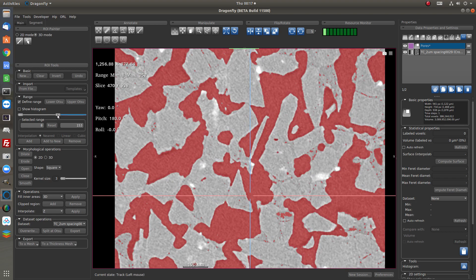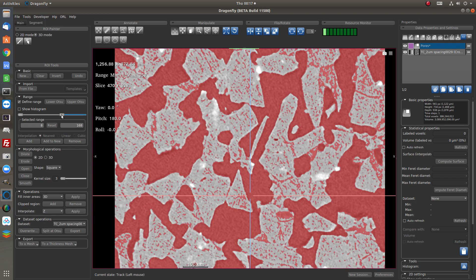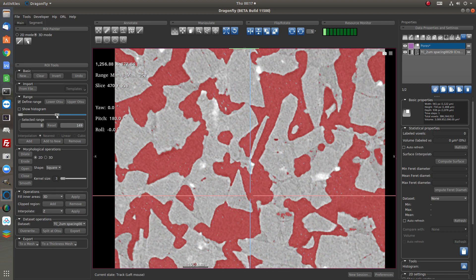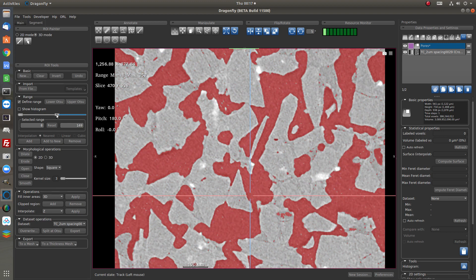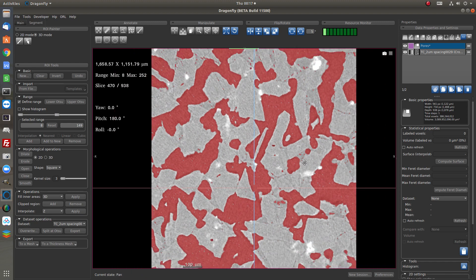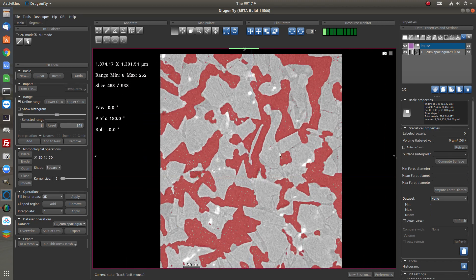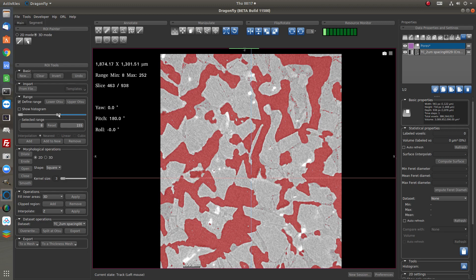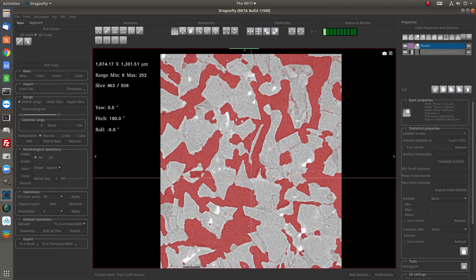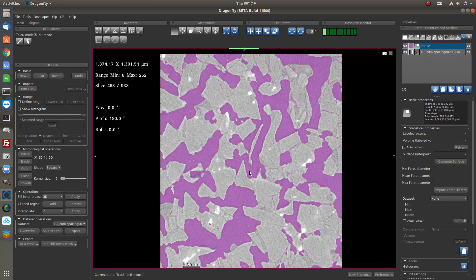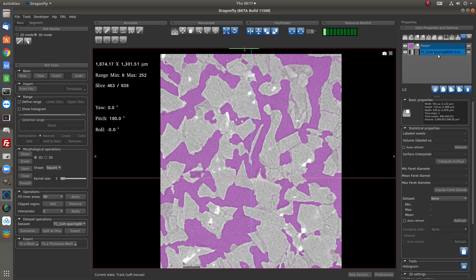So we can change the range to find the best threshold for this segmentation. When we have a good range for the pores we add to the ROI. Now I have added all the pixels in this range to this ROI.